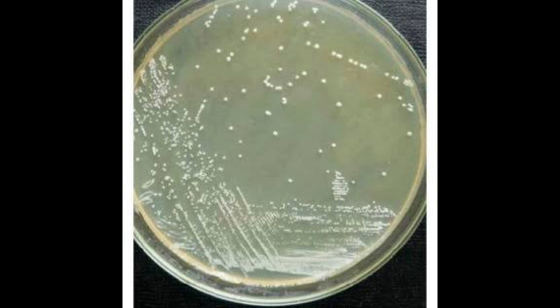When you add media and agar, it will form a solid support in circular petri plates. And when you incubate, after incubation time, you will see certain white colonies, or colonies can be of any type, any color. So you will see different colonies forming. Now how will you do that?